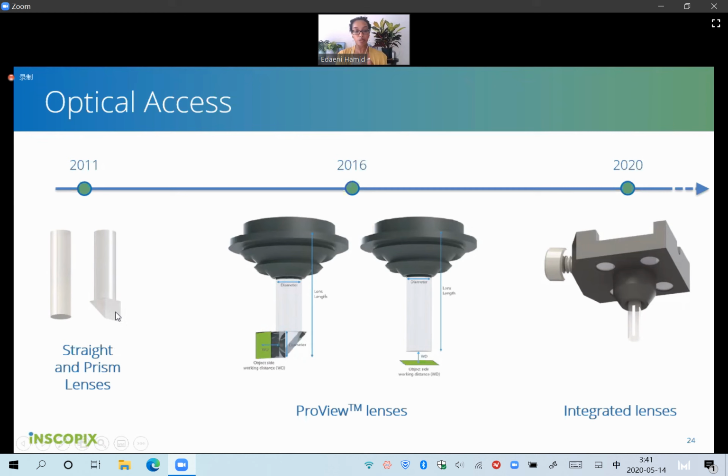But again, when we're talking about the prism, we are talking on this side, right? When we're talking about the straight lens, we're talking about from this point of the lens all the way down. But in this case, it's from here to here. So the lens range is actually a lot more than even the microscope range. But when talking about imaging in the brain, because the brain is quite a fatty tissue and light scatters, going beyond 300 micrometers is not always essential. So you would be able to get exactly what you need with the prism lens.